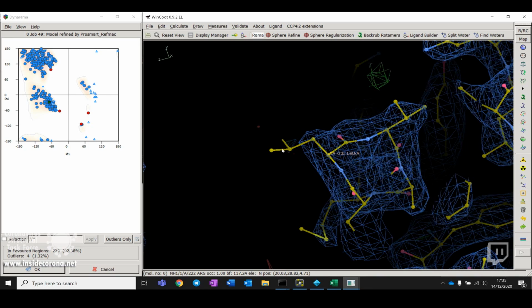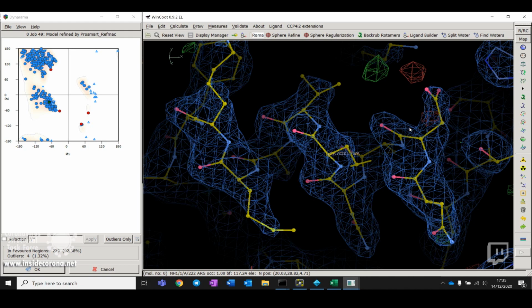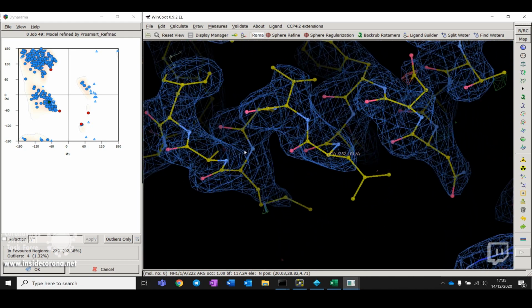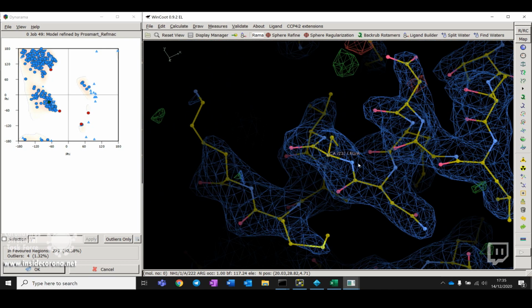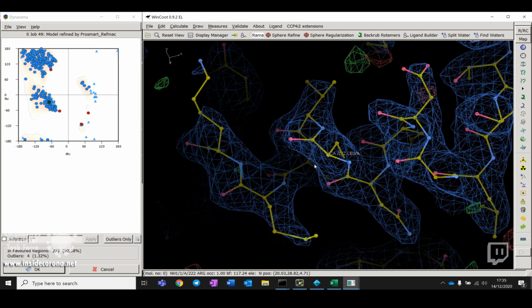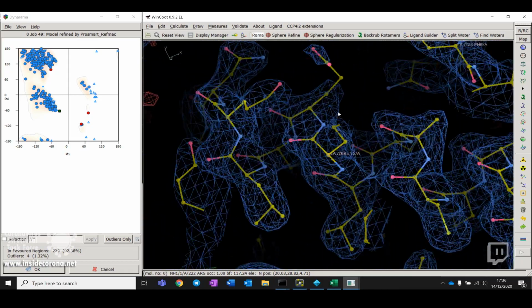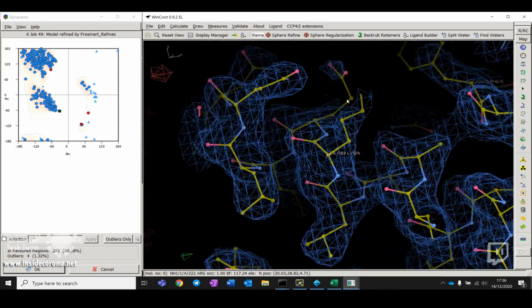The second type of secondary structure is an alpha helix, which you can see here. You can kind of see this coiling around, and again, this is governed by nitrogen and oxygen interactions. This also has defined angles that we know typically make up an alpha helix. So if we look at this outlier here, this is still obviously making a helical shape, but our bond angles are just maybe a little bit off.